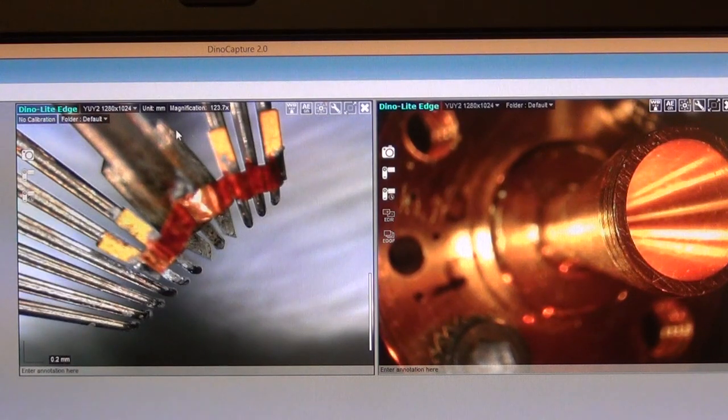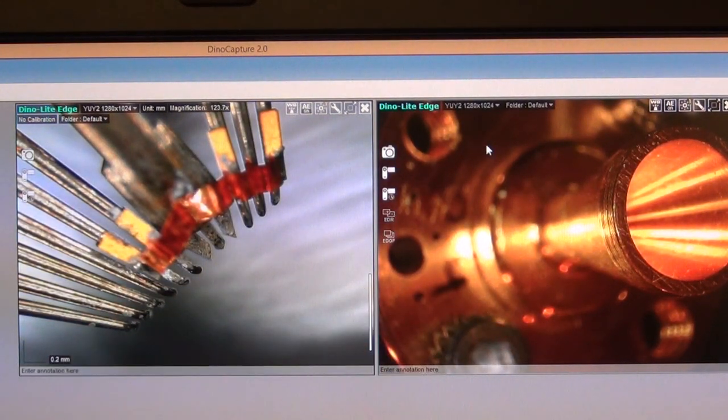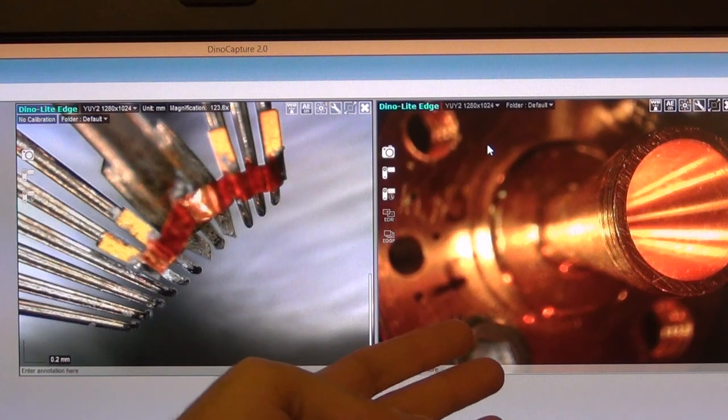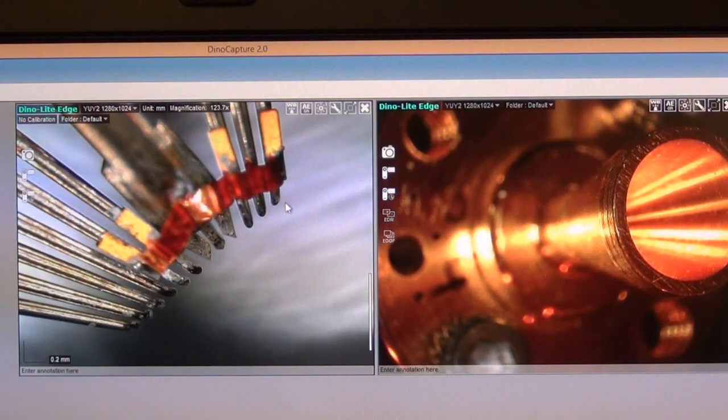But anyhow, don't worry about the fact that this doesn't have this, because you can use that ruler I showed you and calibrate the distances here. And once you calibrate the distances, then you can easily get the magnification value from here too. But anyhow, I haven't done that. So I remember I said that these are supposed to be 450 microns apart.